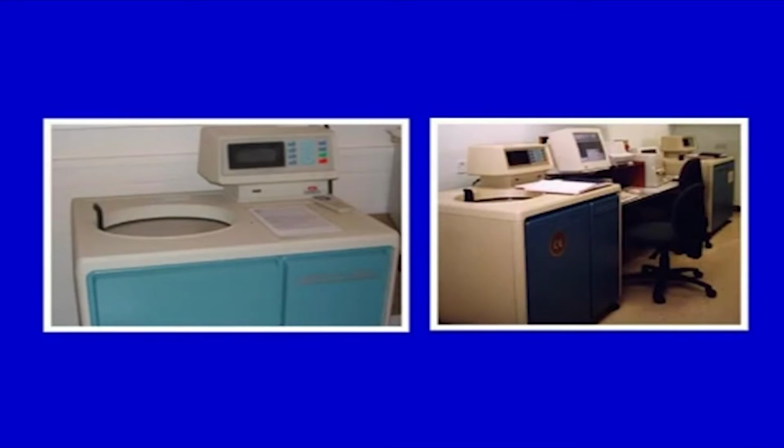A typical analytical ultracentrifuge looks like this, and it has all the controls and other things, and also it will contain an optical system here. So, these are just two representations of that. Now, depending on the type of optical system used in analytical ultracentrifugation, sedimentation in an ultracentrifuge is observed in a particular way.